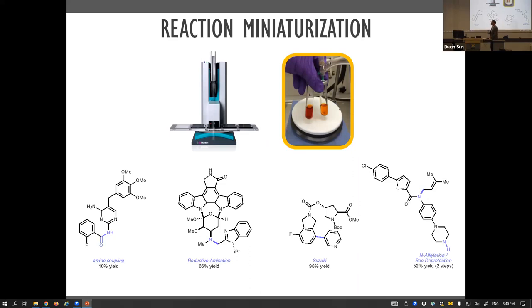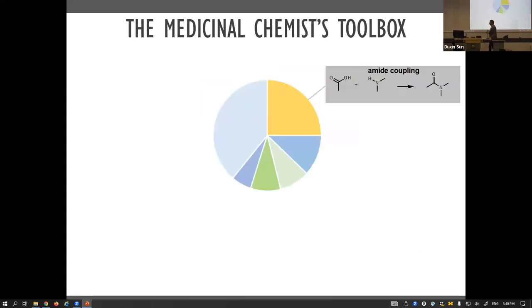One thing that's important with these particular reactions is that they're homogeneous. And so here are these reactions run in test tubes. You can see that they're clear liquids. And so that's important because we do all of our work, at least in this automated format, using liquid handling robotics. And so things need to be liquids if they're going to be handled by liquid handling robotics. And so it's actually quite challenging to find reactions that are nice and liquidy, because keeping in mind that we use lots of manganese and molybdenum and copper and iron, and these things, they don't really care that I wanted to use a robot that only likes to work with liquids.